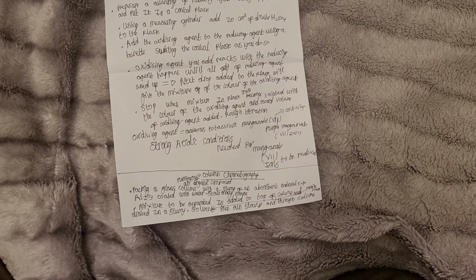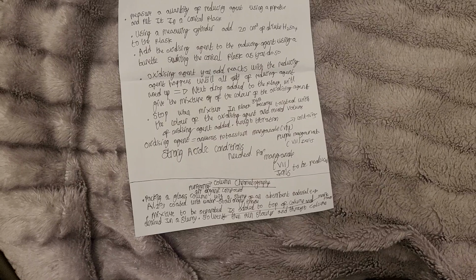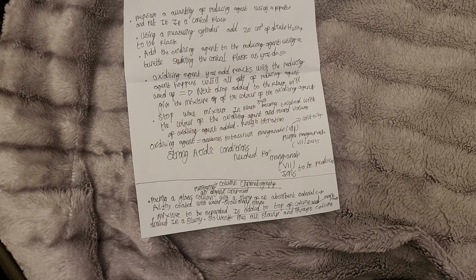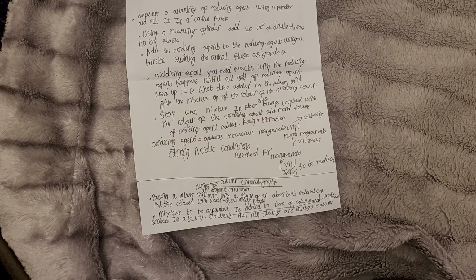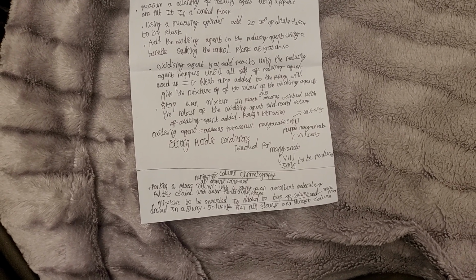Column chromatography. So basically, this is used for purifying an organic compound. We're packing a glass column with a slurry of an absorbent material, for example, aluminium oxide coated with water, stating this is the stationary phase. The mixture to be separated is added to the top of the column and drained into the slurry.